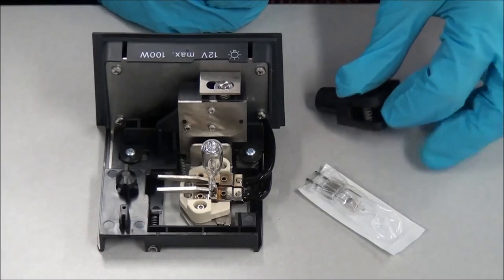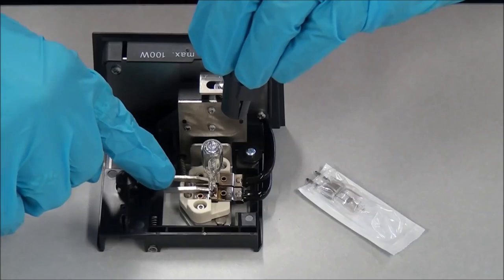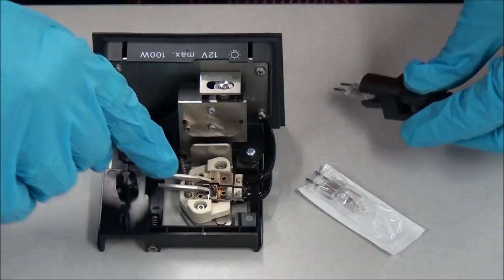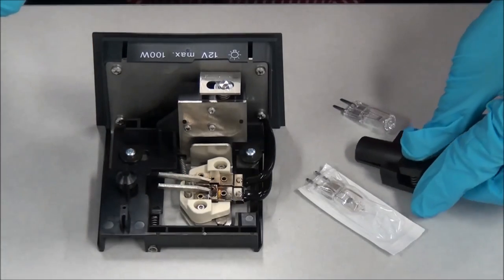While pressing down on both spring-loaded clips, grasp the old bulb securely with the replacement tool. Pull the old bulb straight up and out of the socket and place it to the side.